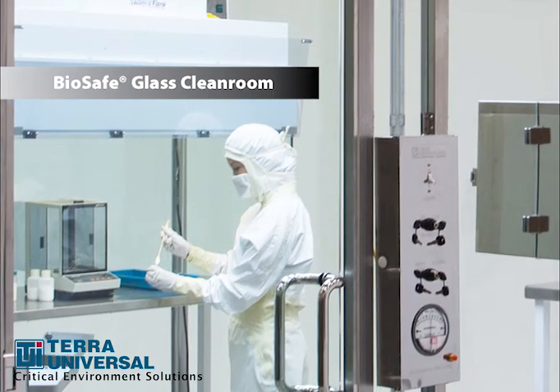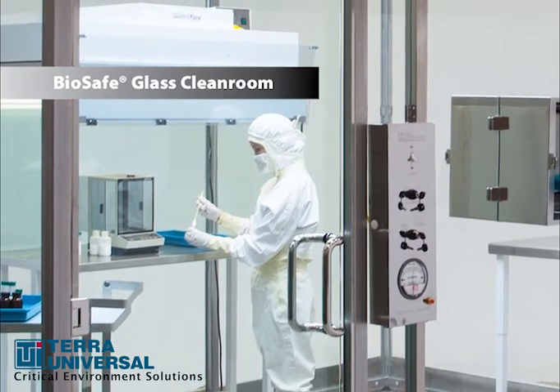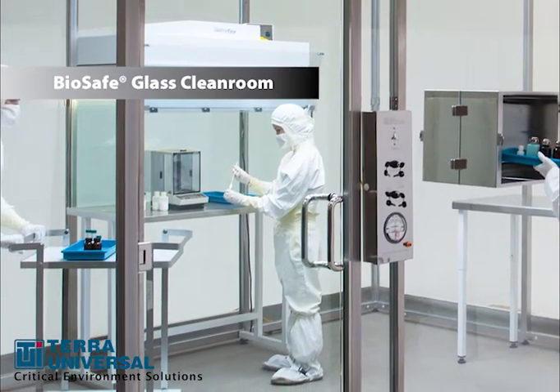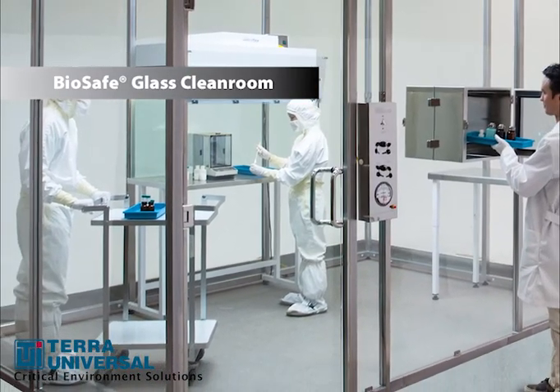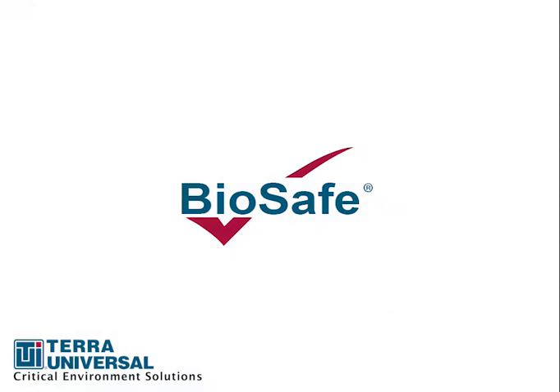Terra Universal's BioSafe tempered glass clean room meets cleanliness standards down to ISO 5. It is constructed of quarter-inch transparent tempered glass wall panels and an all-steel frame. These materials are non-porous, non-outgassing, and will not generate particles — ideal for a classified aseptic environment. The design and materials live up to Terra's strict BioSafe brand cleanliness criteria.